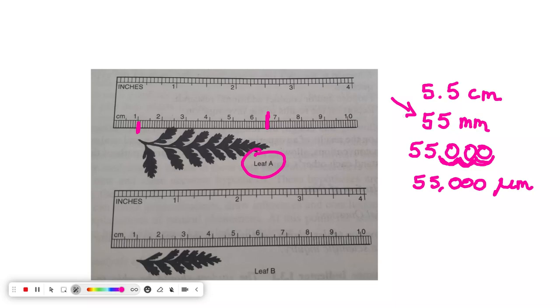So another question is how much longer is leaf A than leaf B? So we know that leaf A is 55 millimeters. So we'll just subtract. What is leaf B? Well, it starts here, and it goes to about there.